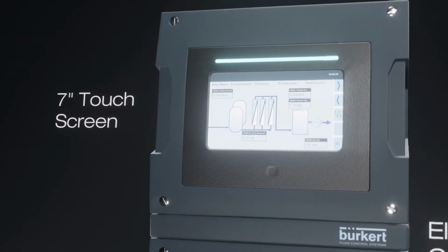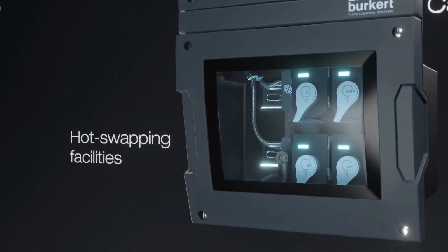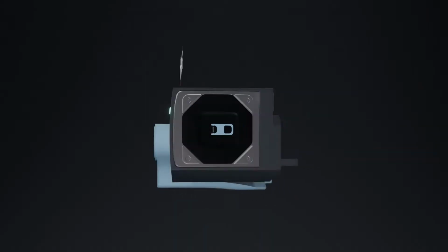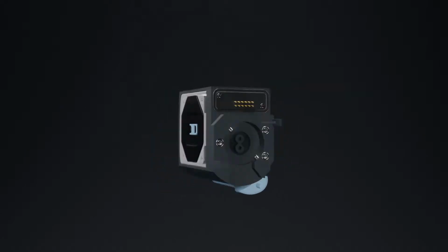7-inch touchscreen display in the upper housing. Secure IP65 electronic module casing. Fluidic housing featuring hot swappable cubes. 6 removable sensor cubes: pH, ORP, conductivity, chlorine dioxide, turbidity, iron.